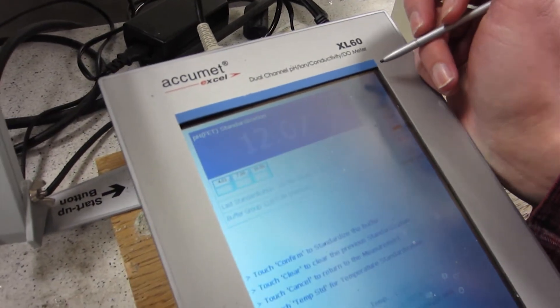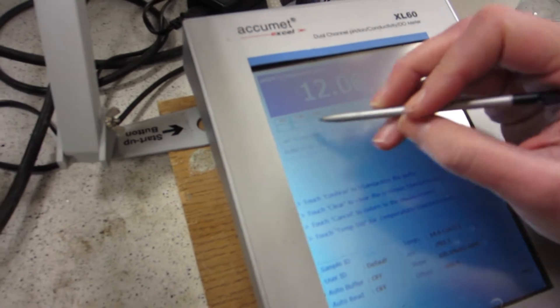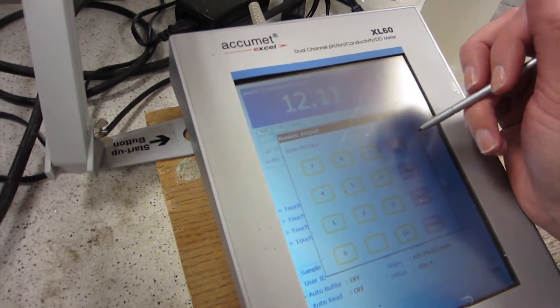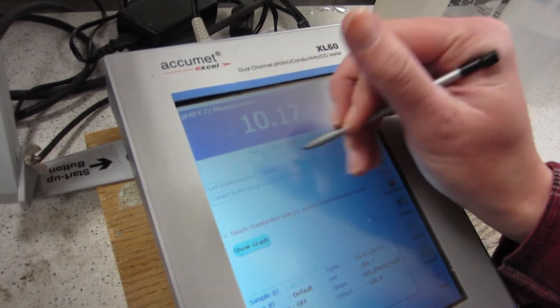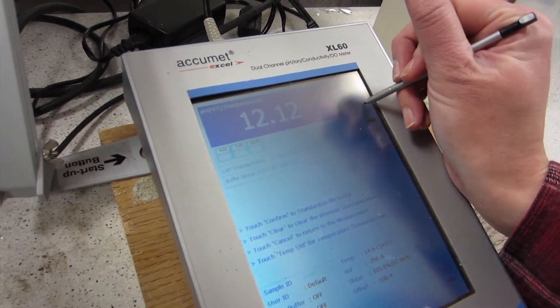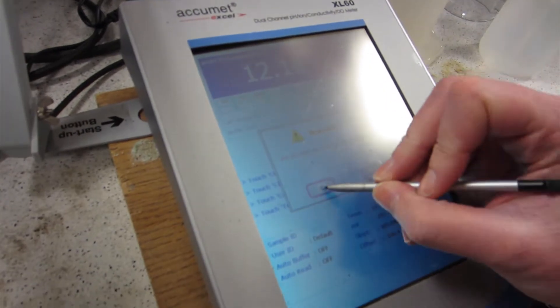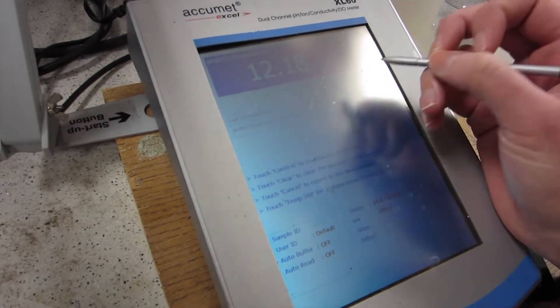Standardize first, and then you're going to clear the last standardization. You're going to want to standardize this every single time that you come in the lab. This is from the previous time, so you want to clear this out before you make your own standardization. You want to clear the whole thing, so you hit OK, and that clears out.